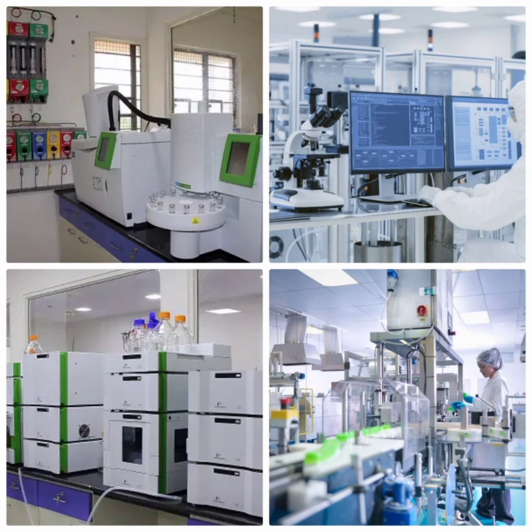We have seen that GC is suitable for oil, plant pigments, pesticides, fatty acids, toxins, petrochemicals, air samples, drug abuse testing like cocaine. For the case of HPLC, we have seen that it is suitable for inorganic ions, polymers, sugars, nucleotides, vitamins, peptides, proteins, lipids, tetracycline analysis, etc.